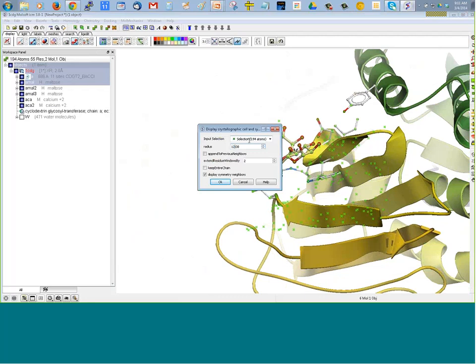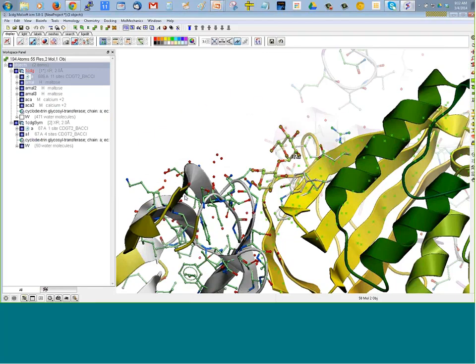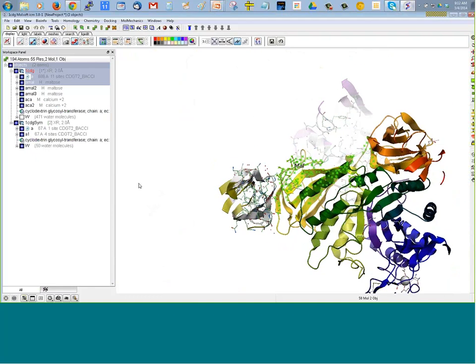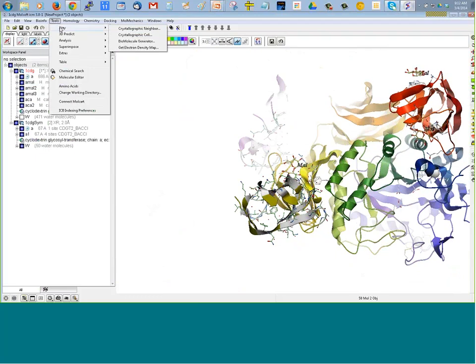It's telling us the selection. These options just to increase the selection a little bit, and exactly what you'll display. We'll just press OK and we'll see what we get. So here we see that we built the neighbors.